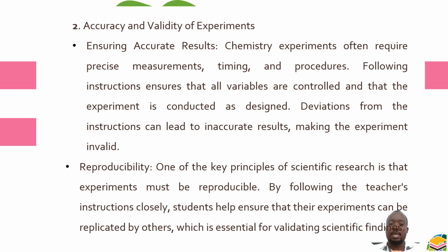There's also the need for reproducibility. So one of the key principles of scientific research is that experiments must be reproducible. By following the teacher's instructions closely, students help ensure that the experiments can be replicated by others, which is essential for validating scientific findings.